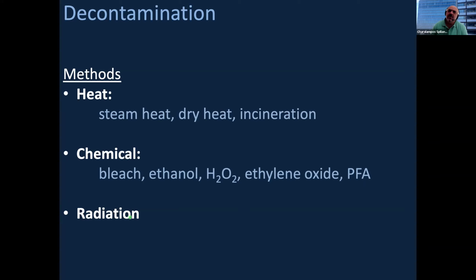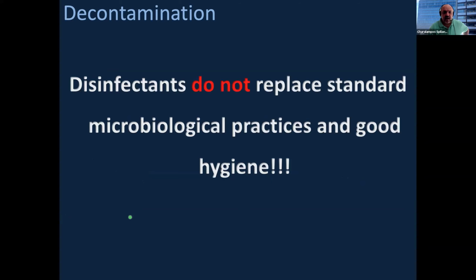I remember there was a container where we would put our pipettes in order to provide radiation and kill all microorganisms that potentially had contaminated our pipettes. And I think we do have that at the IMBB.